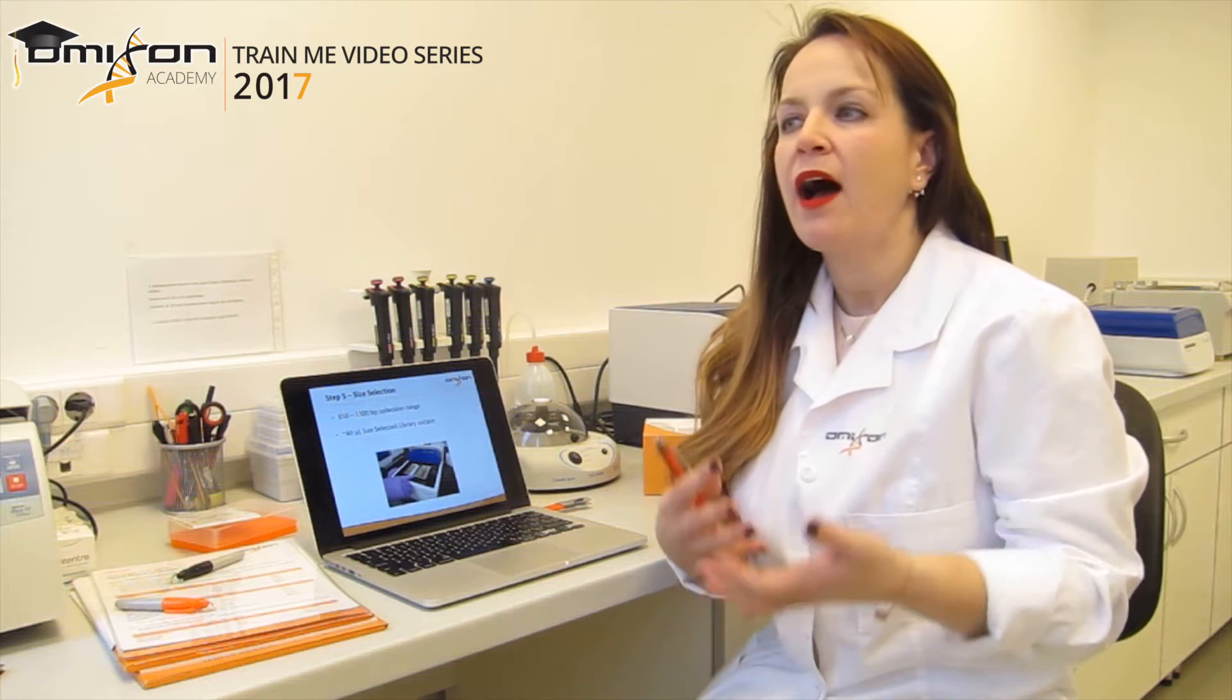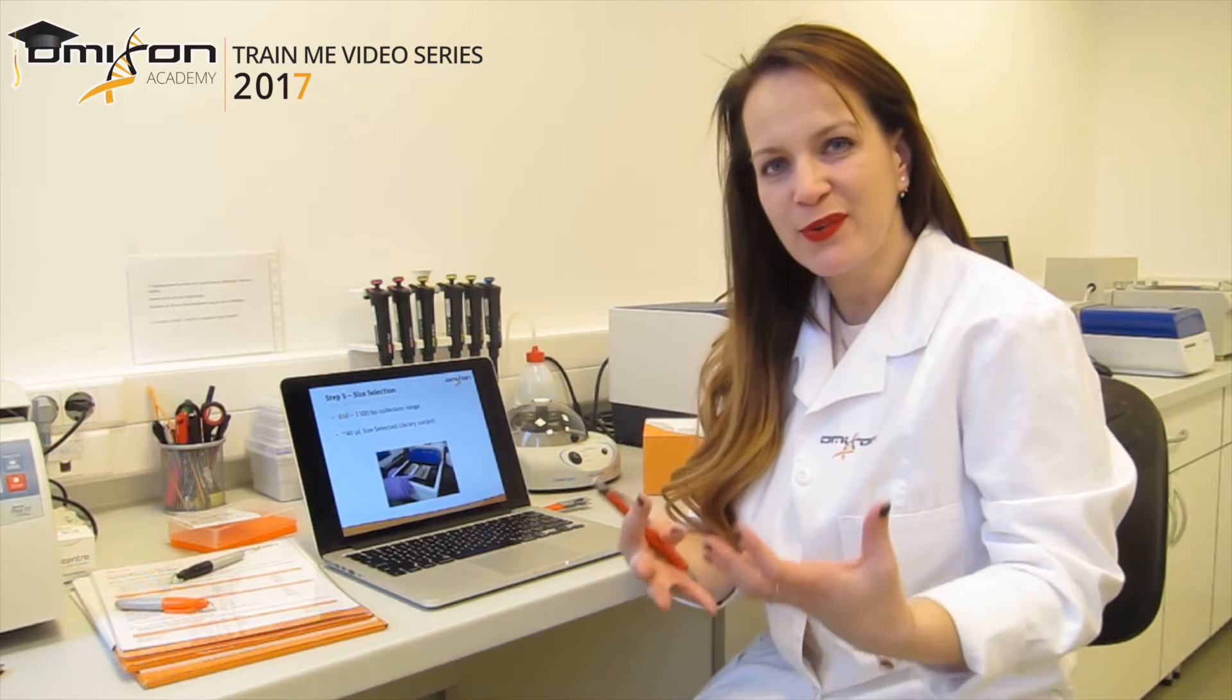Let me explain to you how this machine works. As you probably already know, we use an automated method to do size selection. The machine is called PIPing Prep and it is made by Sage Science, a company in the United States. It's actually a very simple method and sometimes I wonder why I didn't think of it beforehand. It's a very basic principle.